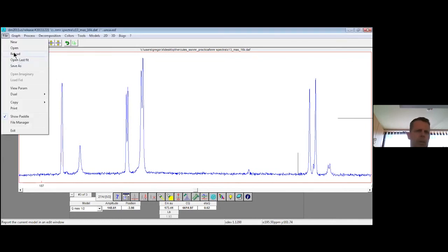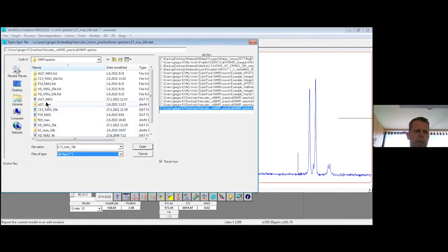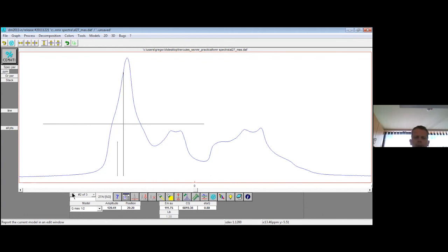And for example, the aluminium spectrum again, and from a wealth of knowledge in the literature, you can learn that typically signals that have isotropic positions with chemical shifts of about 0 or slightly negative, in the range between, let's say, 10 or 20 to -20, belong to octahedrally coordinated aluminum sites, whereas signals which have shifts of let's say about 20 or so might be 5 coordinated.